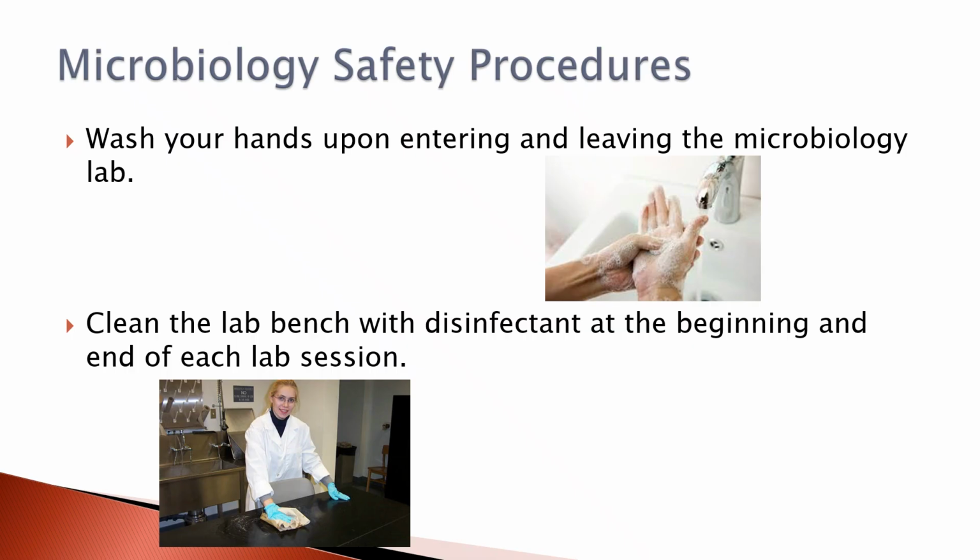The upper levels, 3 and 4, those are only going to be in research labs and medical labs, so you're not going to see those on campus.